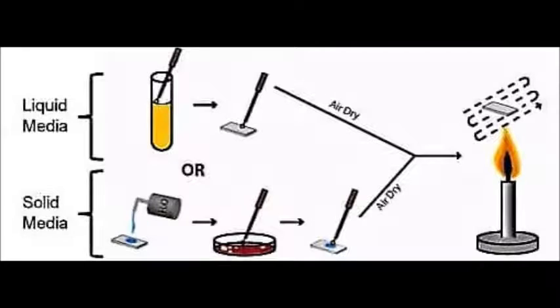Now I'm going to discuss the process of gram staining. The first thing you'd want to do when you get your stuff is to start your flame. Get your slides, sterilize your slides by passing them through the flame 3 or 4 times. From that point, you would want to let your slide cool. Then you go on to retrieve your loop. Sterilize your loop by putting it through the flame until it's glowing red.